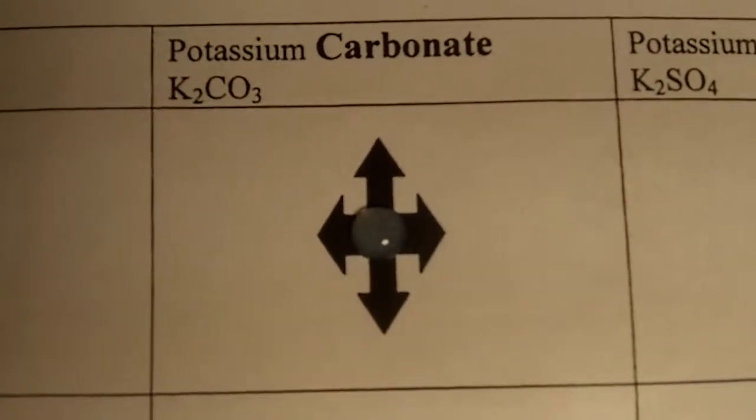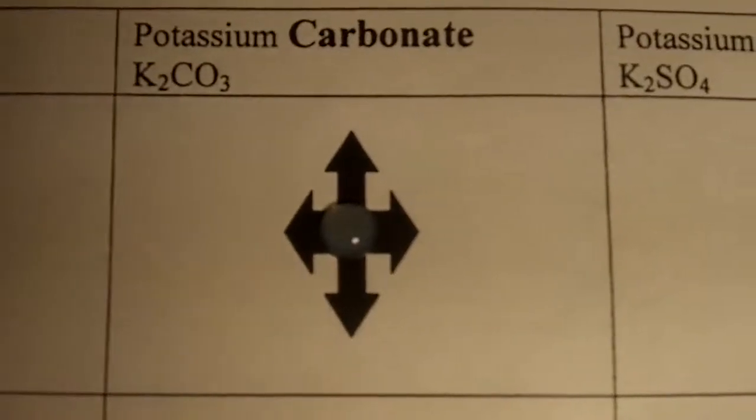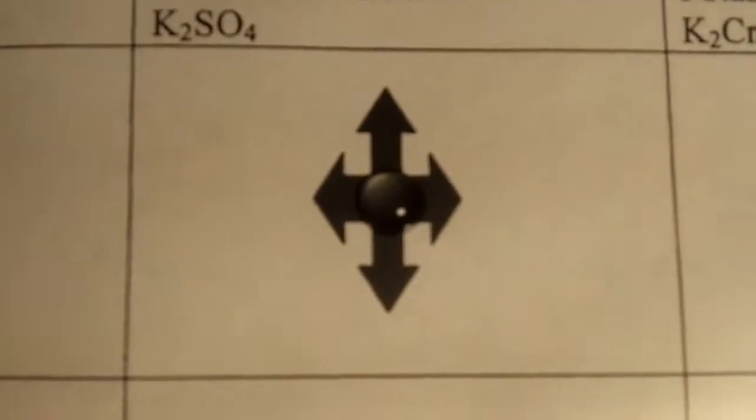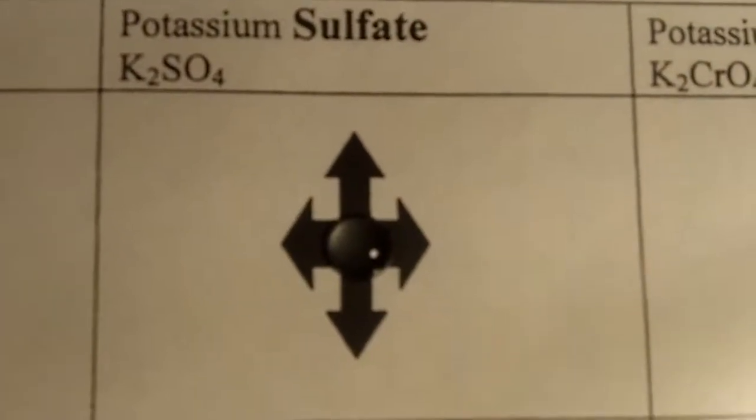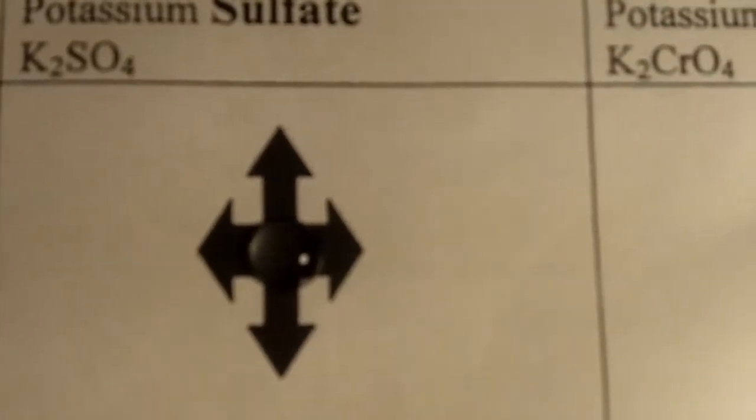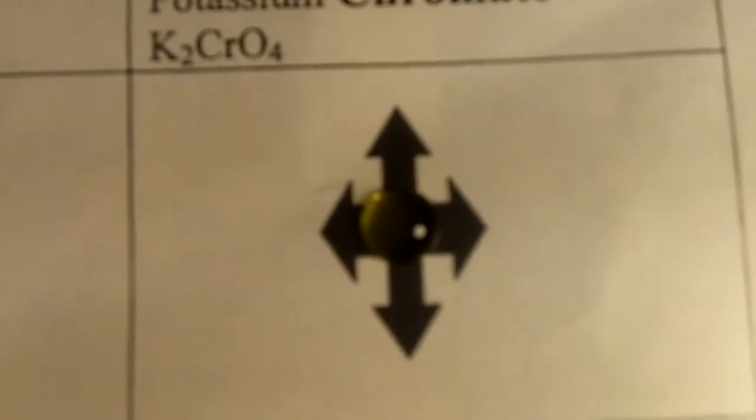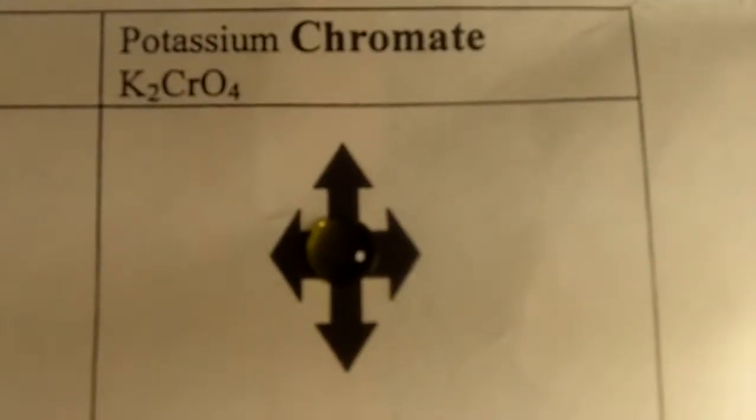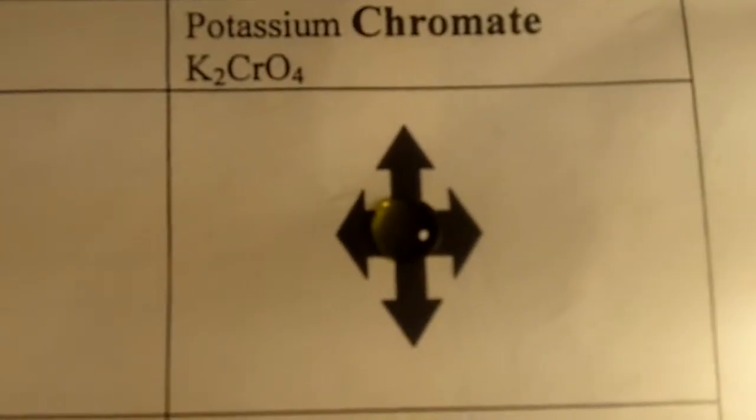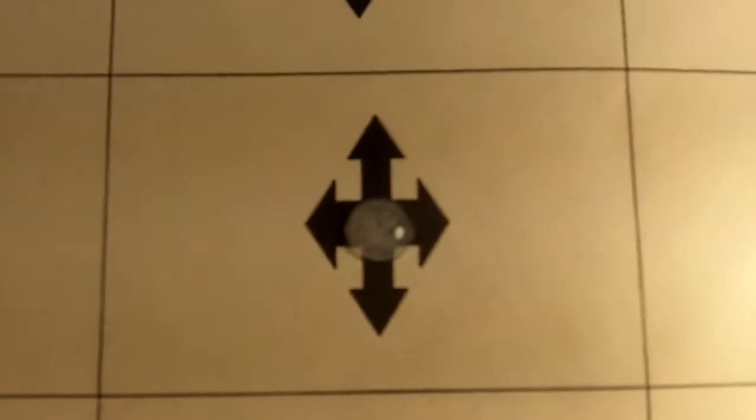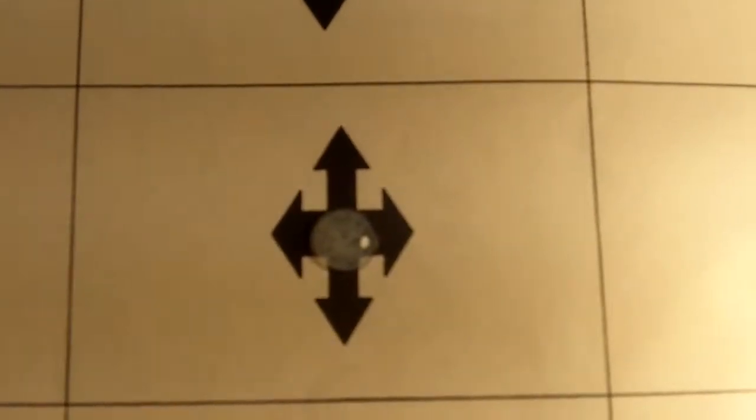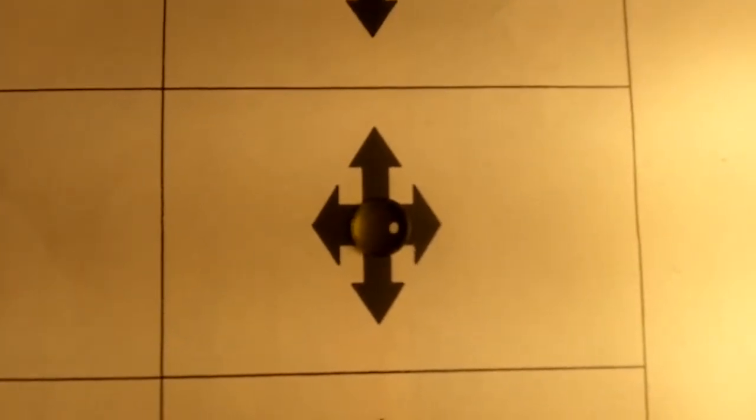So this first row that you're looking at, this is the magnesium nitrate and the potassium carbonate. This is the magnesium nitrate and the potassium sulfate. And the last one is the magnesium nitrate and the potassium chromate. Okay, now we're going to move down to calcium nitrate. And the first one that you're looking at, this is the potassium carbonate and the calcium nitrate. This is the potassium sulfate calcium nitrate reaction. And the last one is the potassium chromate calcium nitrate reaction.